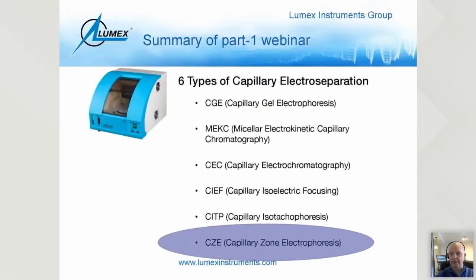All right. So let's jump into today's webinar, and part of the summary of what we've covered last time was I mentioned at first that we had 6 types of electroseparation, and they're all listed here. And of course, we're going to zone in on the capillary zone electrophoresis, because that's basically the technique, I would say, that covers most of what you need to understand for capillary electrophoresis and how to operate.